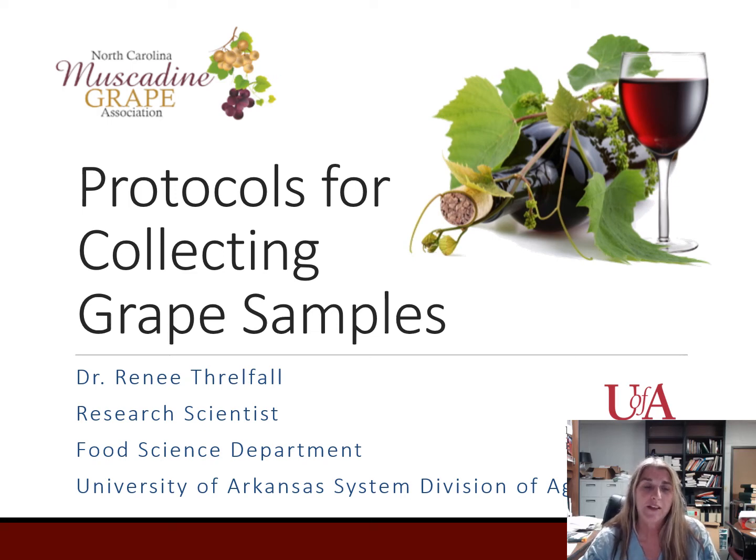I am Dr. Renee Threlfall. I'm a research scientist in the Food Science Department at the University of Arkansas System Division of Agriculture. I'm going to talk to you today about the protocols for collecting grape samples with a focus on muscadine grapes.